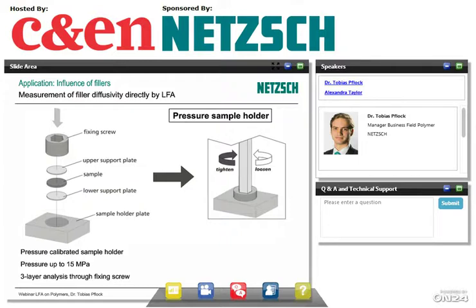An arrangement like that could also be used for amorphous samples, so you don't lose the sample when it softens above the glass transition temperature. In general, amorphicity just gives you different transport properties than for crystalline samples, but that's actually what you want to measure. So there's no special care that you have to take if you want to measure amorphous samples.